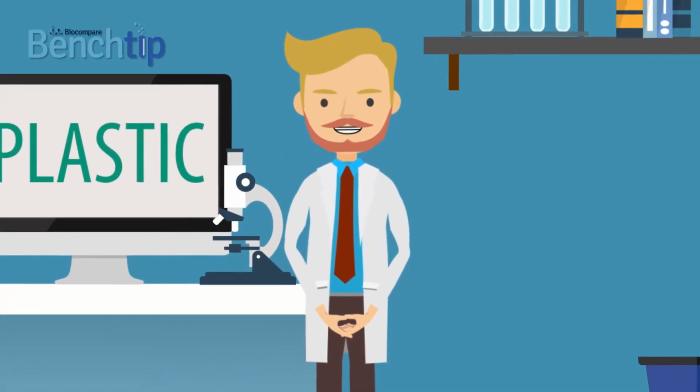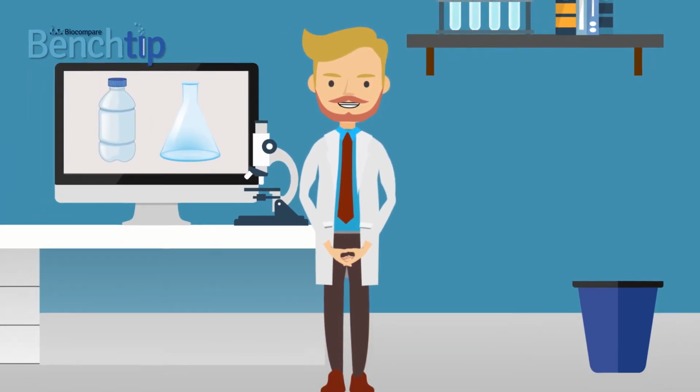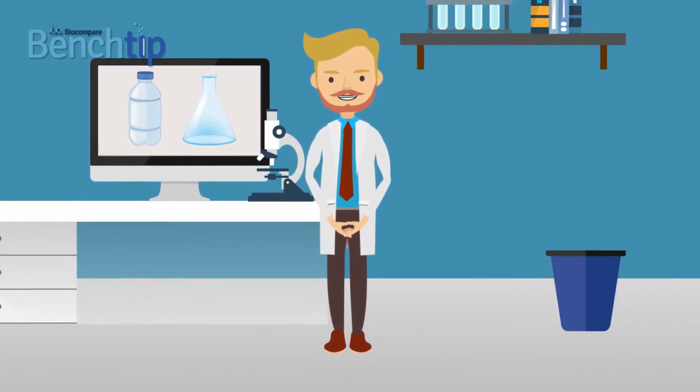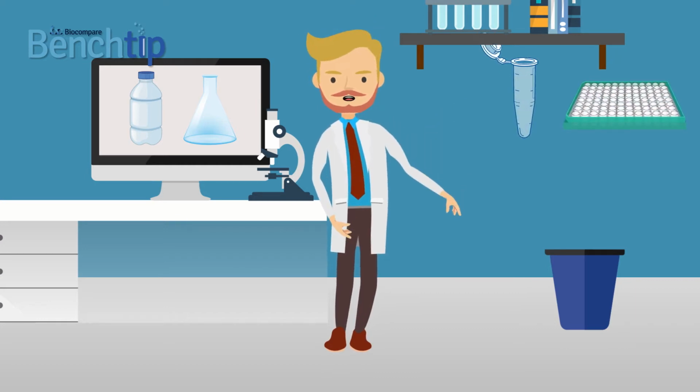Biologists have been using plastic labware for decades. Plastic is tougher than glass and breaks less easily, is lighter, and is less expensive. And plastics are disposable. Use a plastic tube or microplate once, then throw it away.